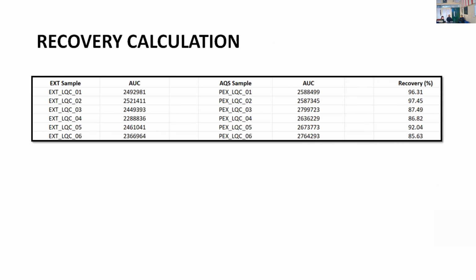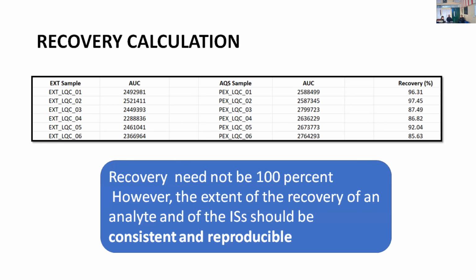So here, this is post-extracted and extracted. We will divide that area and check for the recovery. The recovery need not be 100%. However, it should be consistent and reproducible.